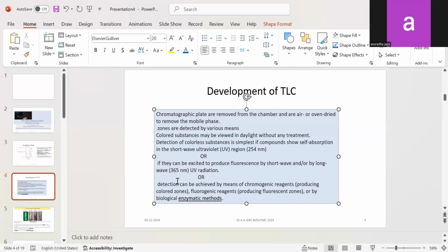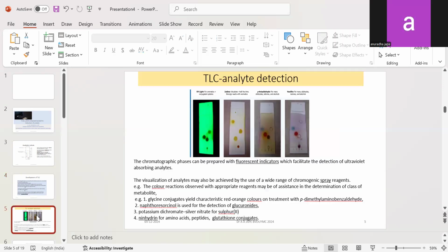And when such a fluorochrome is there in the TLC plate, kept under UV it will give the fluorescence, and the spots will appear as dark spots against that. So certain destructive and non-destructive methods we will learn as examples. Now here is the first plate wherein we have kept the plate under the UV and it is fluorescing, and the dark spots are the spots of the analyte.